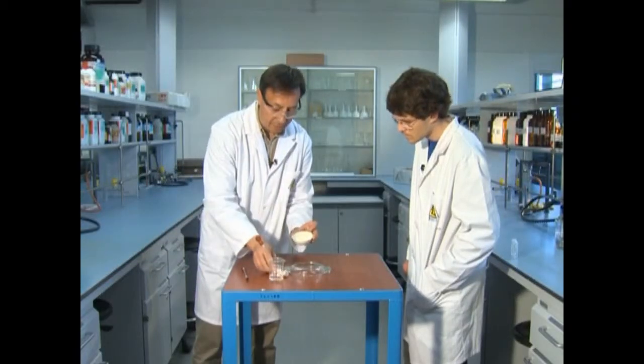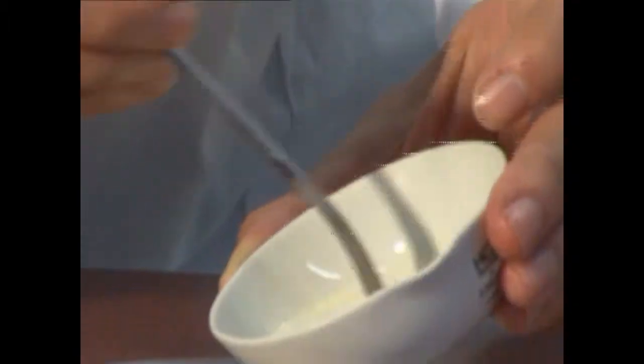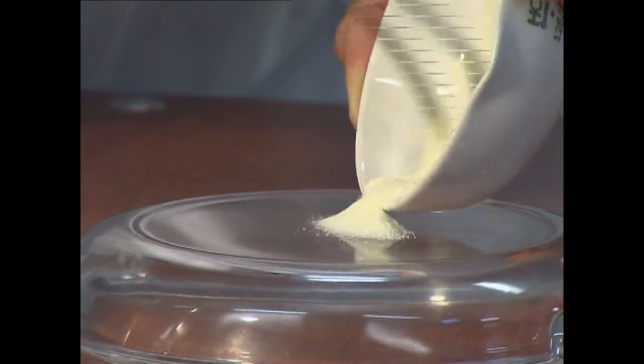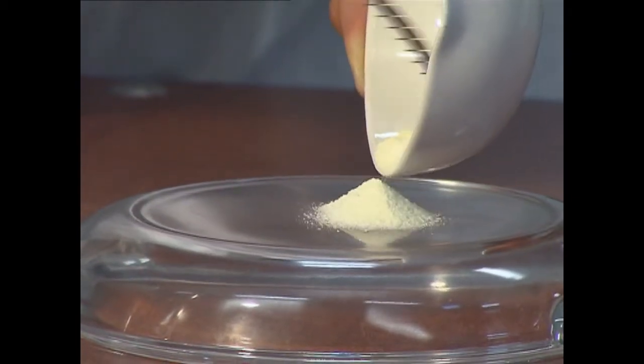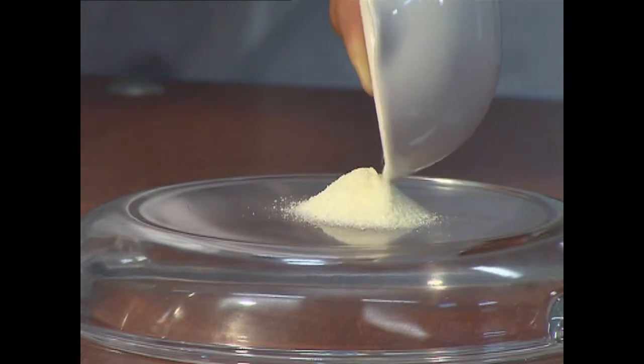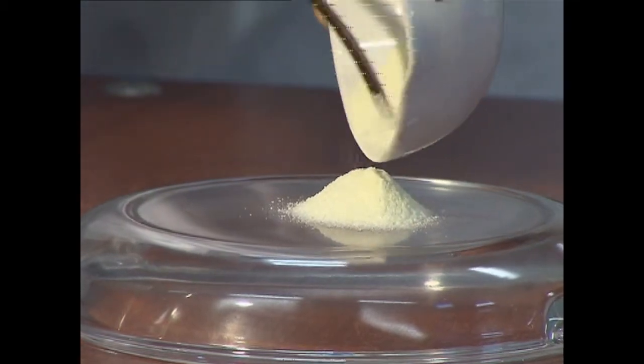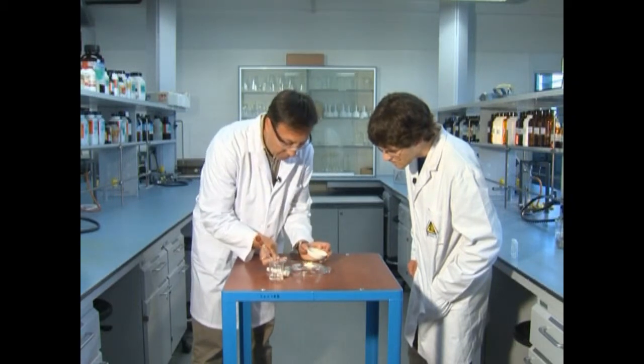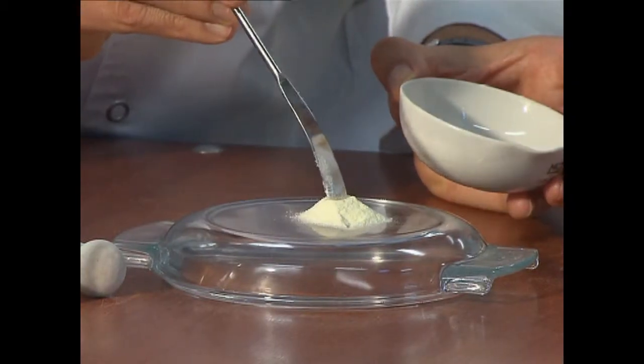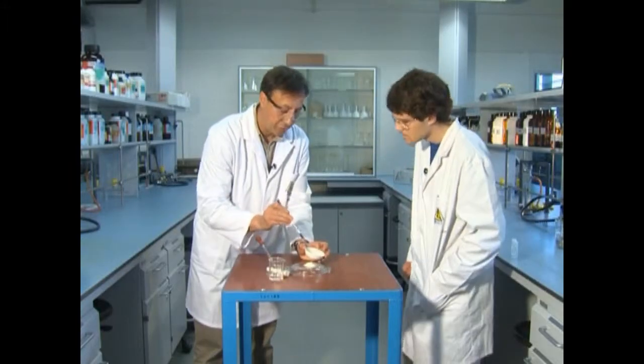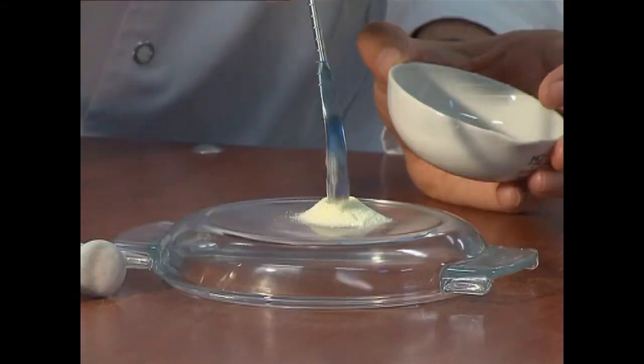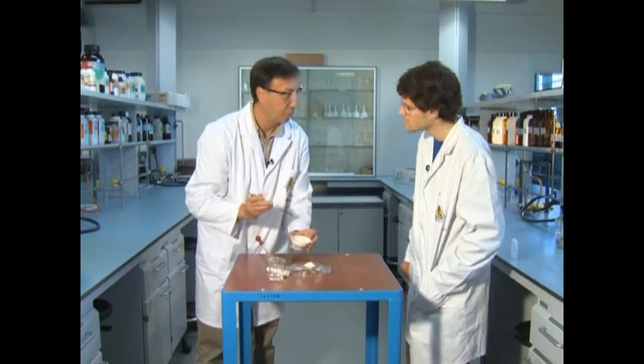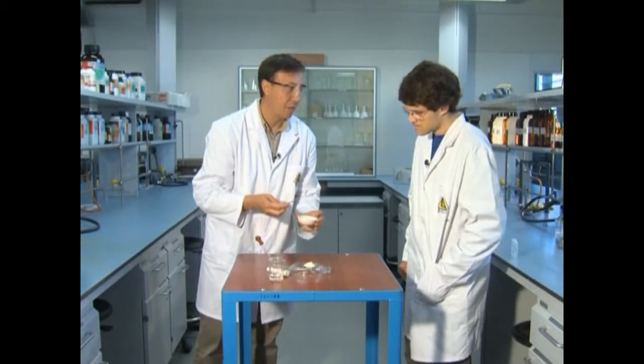I ara el que faré serà un pilonet a damunt d'aquesta placa de vidre. I ara aquí al mig hi hem d'afegir unes gotetes d'àcid sulfúric. Per això he fet aquesta forma com de volcà. Perquè aquí al mig és on posaré les gotes de sulfúric. I ara sí que fem bé de portar ulleres. I tant.